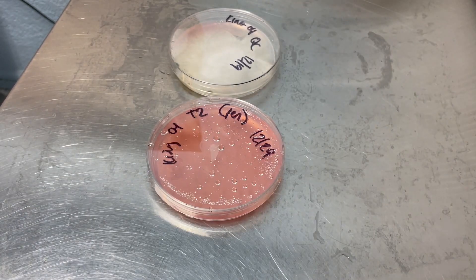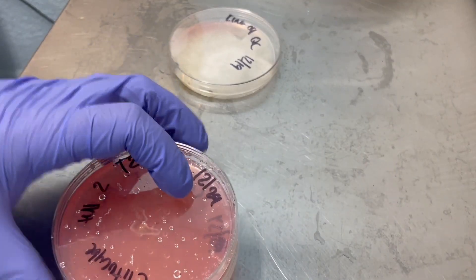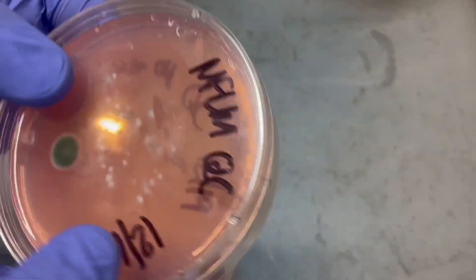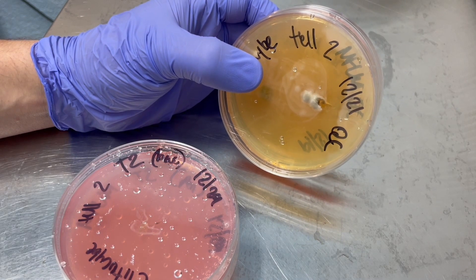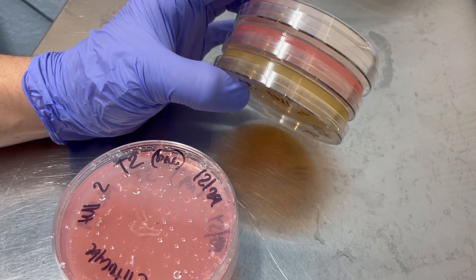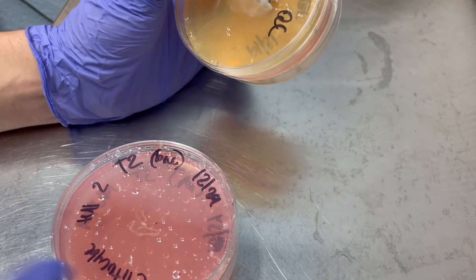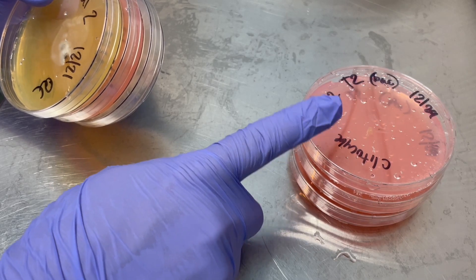And then I can go ahead and discard these old plates. Some people will autoclave them and then throw them out, but I'll just usually wrap them in some saran wrap or something and get rid of them. And now I have backup cultures that can go into the incubator.